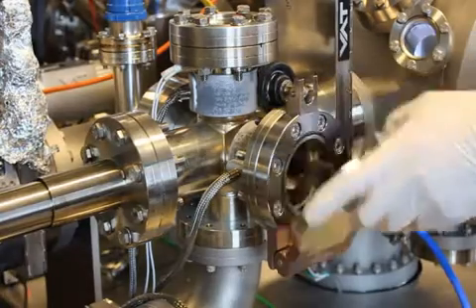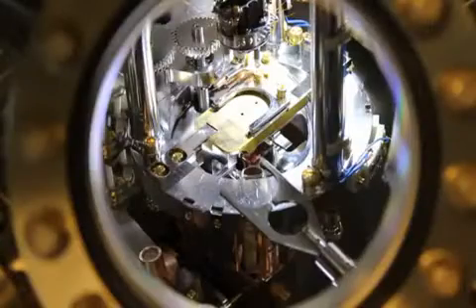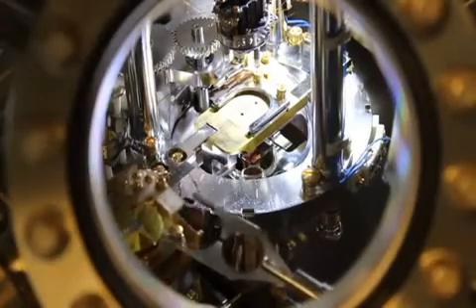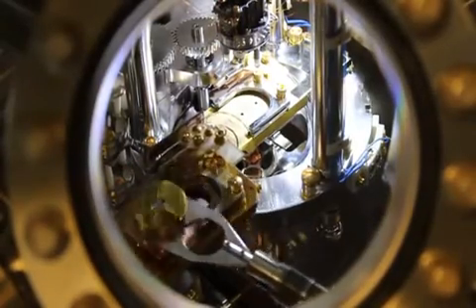After preparation, the sample is transported into our ultra-high vacuum setup and transferred under the scan head of our non-contact atomic force microscope.